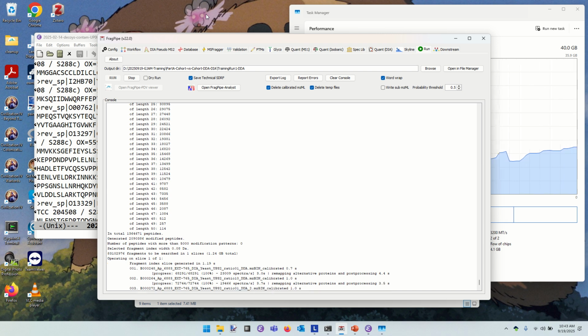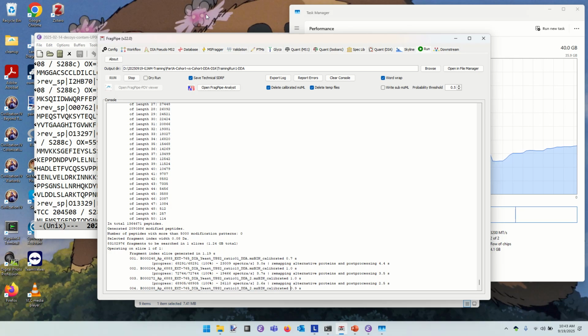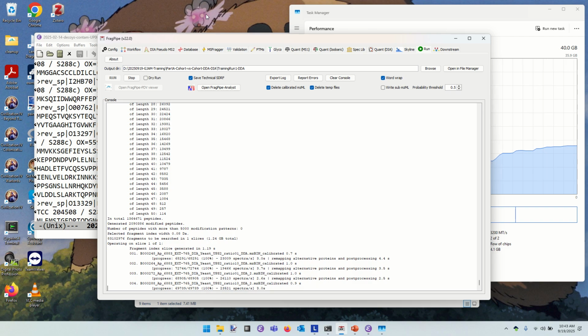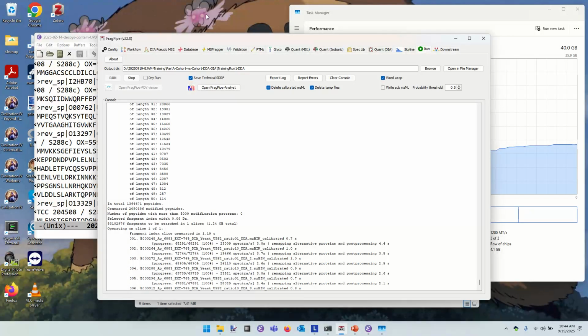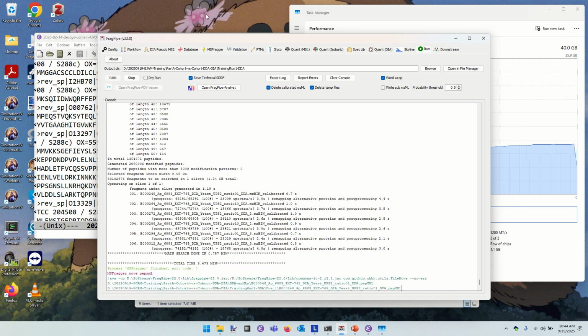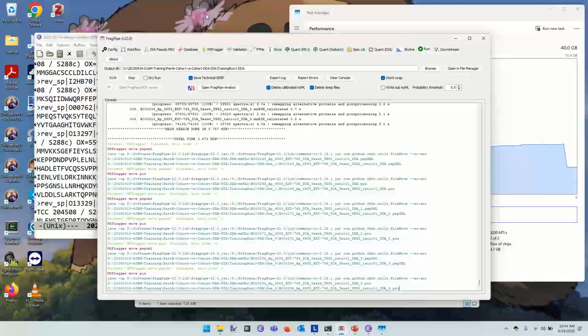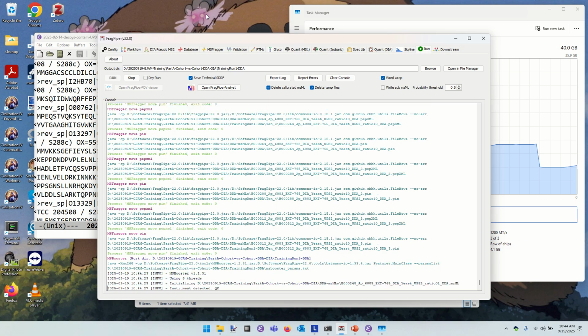Is this running on everybody? No? Insufficient memory. Okay. What does Task Manager show you? Click on the little heartbeat symbol and then click memory. Yeah, something's using a lot of RAM. If you click on that one, and then sort by memory, you can see what's taking up all the RAM. Yeah, there's a Java job that's using the RAM at the moment, so I think that Java job is probably MSFragger. Probably. Okay, but did it stop itself when it had the memory error? Oh, okay.